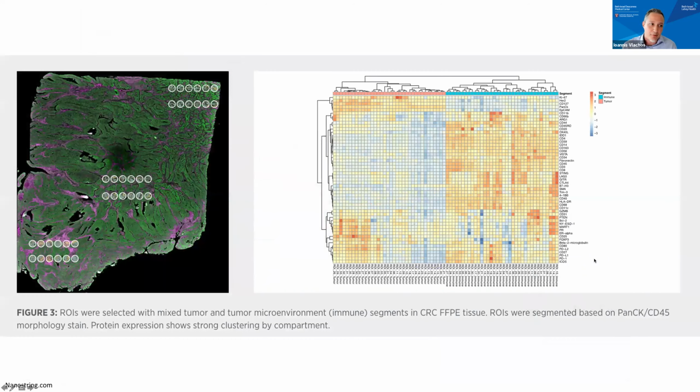So this is an example from the same website for ROI selection. I'm showing this since every assay has its tricks and its important details, and region of interest selection for the GeoMx, I think, can really give you things that maximize your research potential. So this is an example from the website. These are different regions of interest from the same tissue, and you get thousands, or 1,000, or 18,000 genes, depending on the assay, for that region.